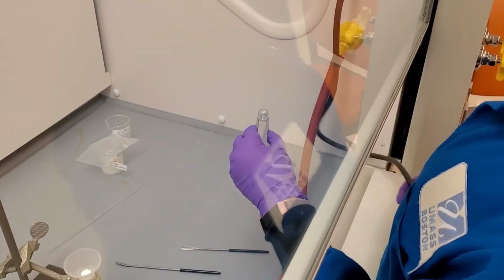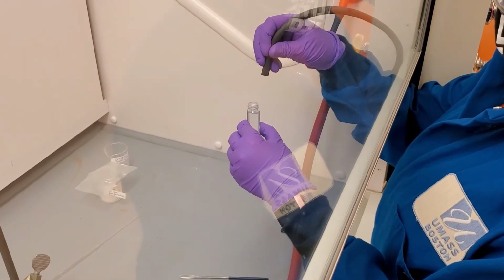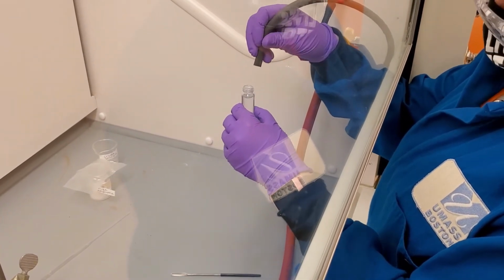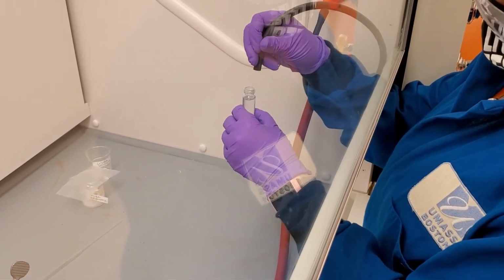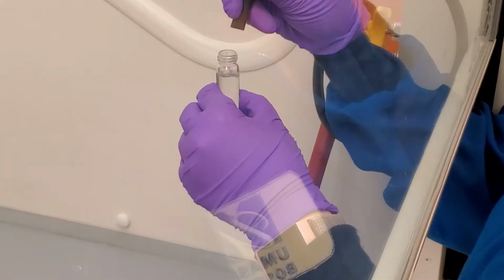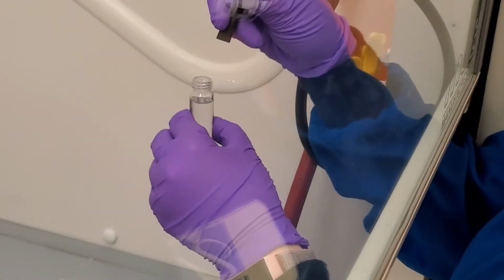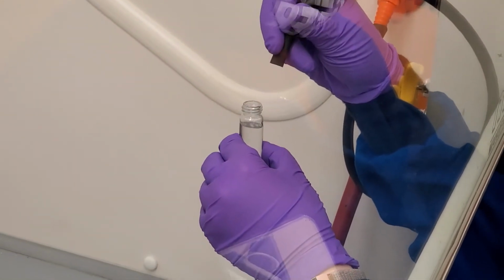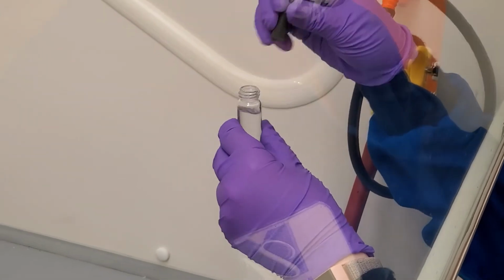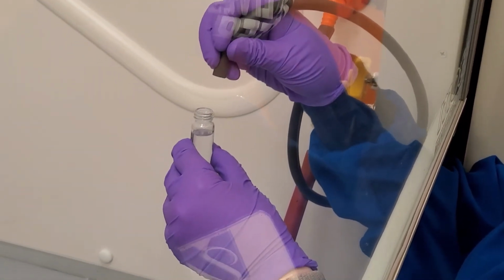Instead of waiting for the ether to evaporate from the product vial, we will use air to quicken the process. We turn on the air nozzle and make sure that the air is flowing gently. We hold the air hose a few inches above the product vial because the solvent is almost at the top of the vial. As the solvent level goes down, as it evaporates, we can move the air hose closer to the vial opening.